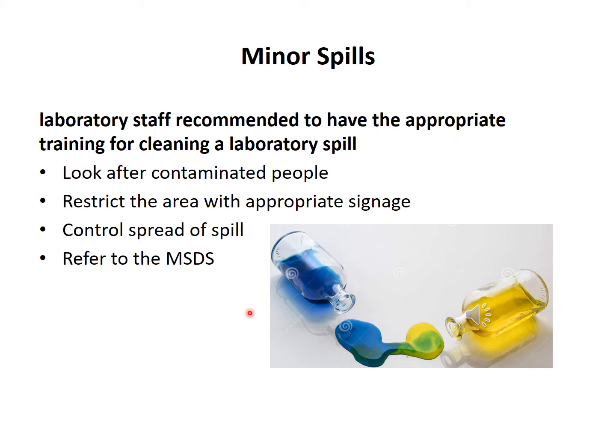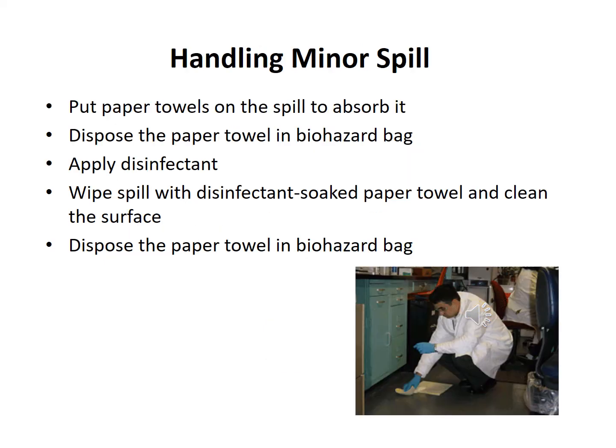And of course go to the MSDS document to see how to clean that particular area. Even if you are calling for the sweeper, at least you can guide that sweeper, because they are not trained to clean chemical spillage or biological spillage, okay. Since you are the expert, you can instruct that person if you have the information, right? And this is how you can handle these minor spills.